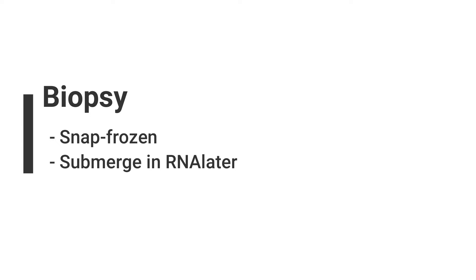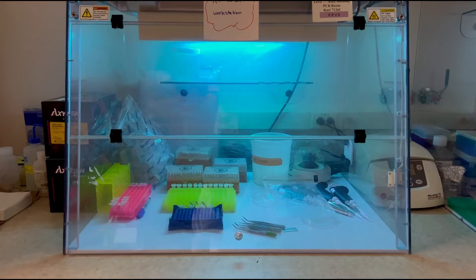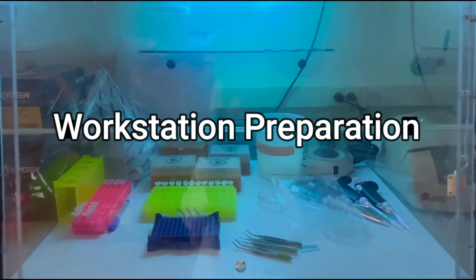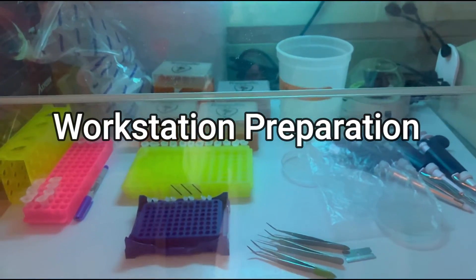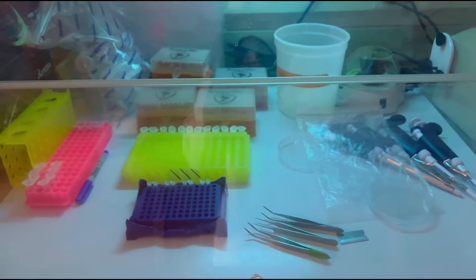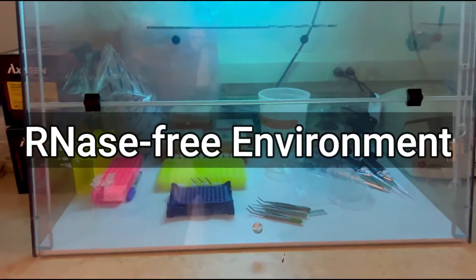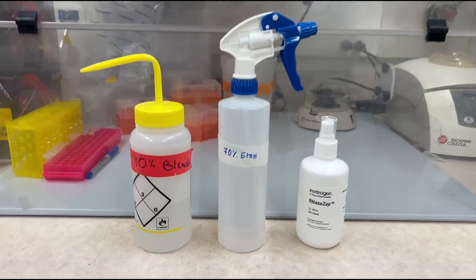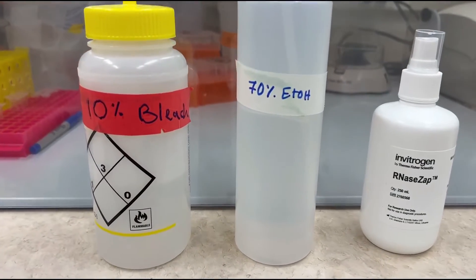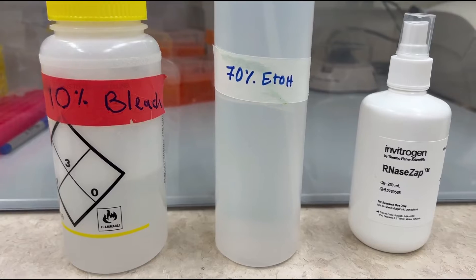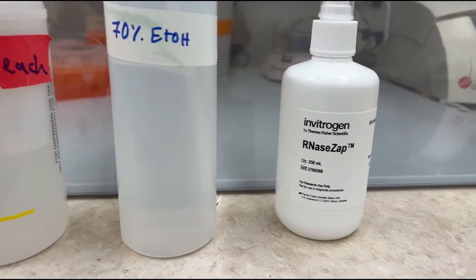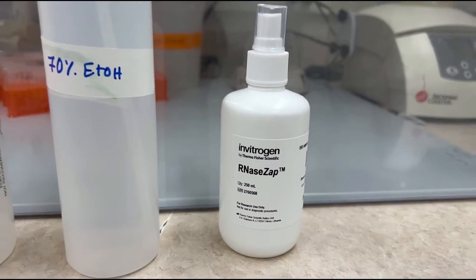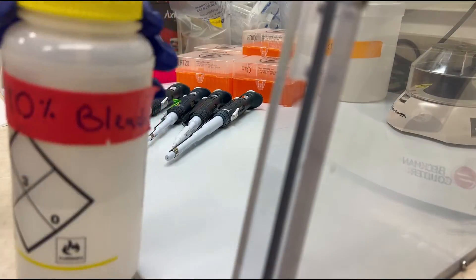With our tissue samples properly collected and preserved, let's move on to preparing the workstation. First things first, let's ensure your workstation is in top-notch shape for RNA extraction. To do so, wipe down your workstation and the pipettes with a sequence of cleaning agents: start with 10% bleach, followed by 70% ethanol, and finish off with RNA zap.